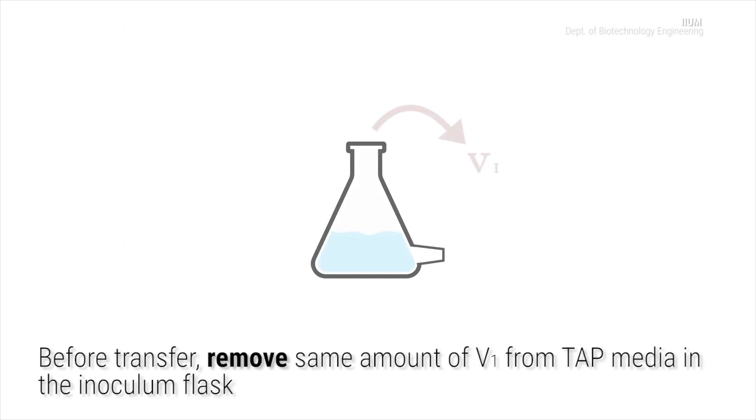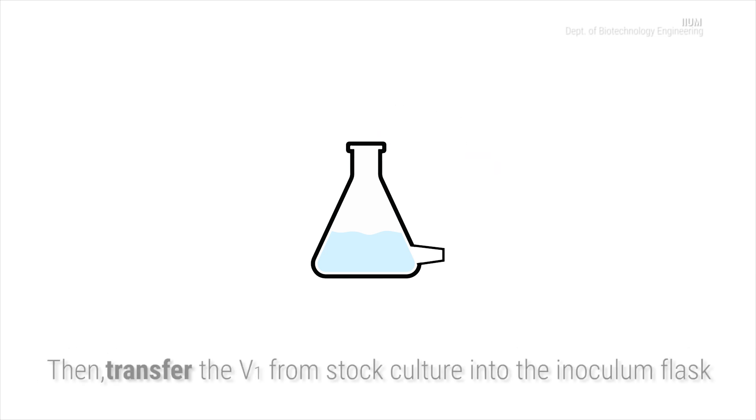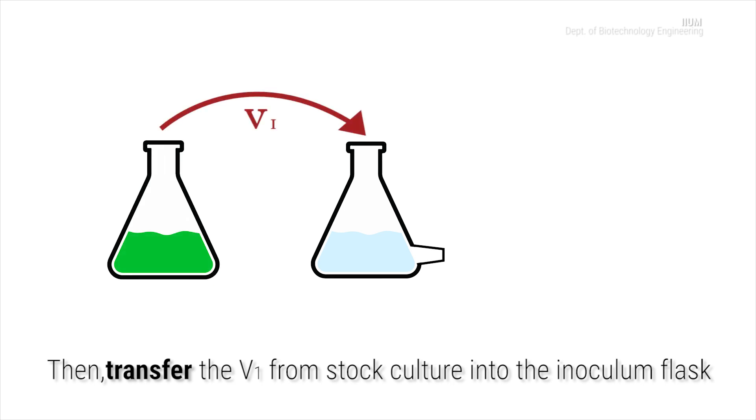Before transfer, remove the same amount of V1 from the tap media in the inoculum flask. Then transfer the V1 from stock culture into the inoculum flask.